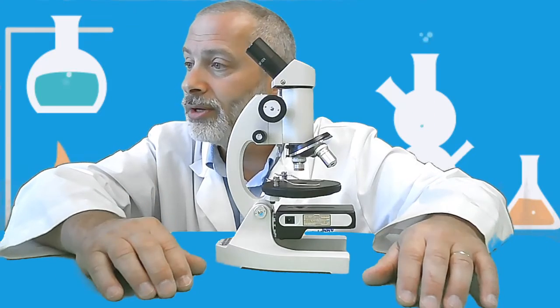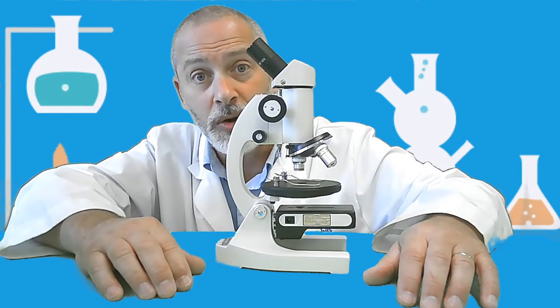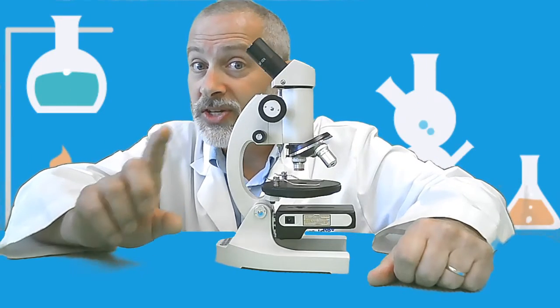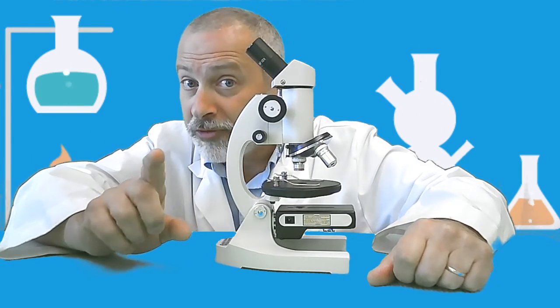Okay, so here are some of the steps we follow when using a microscope. Study those steps before we move on.